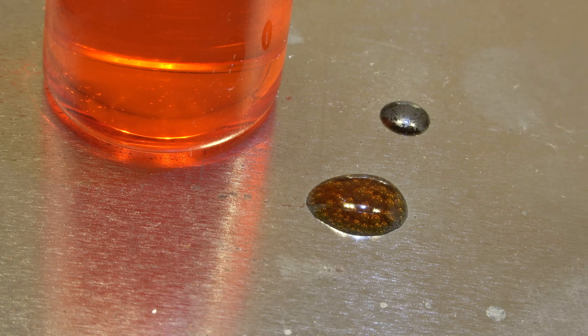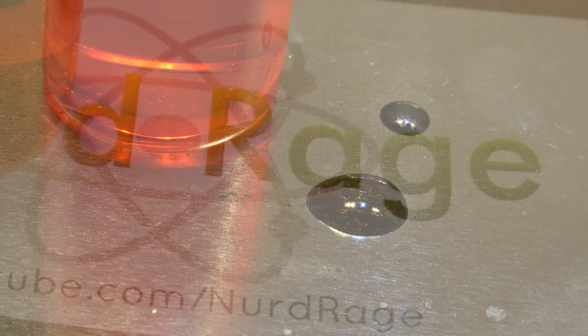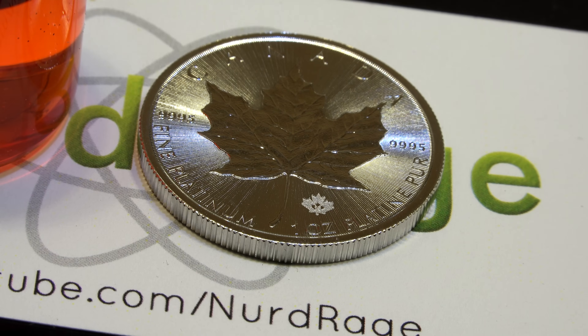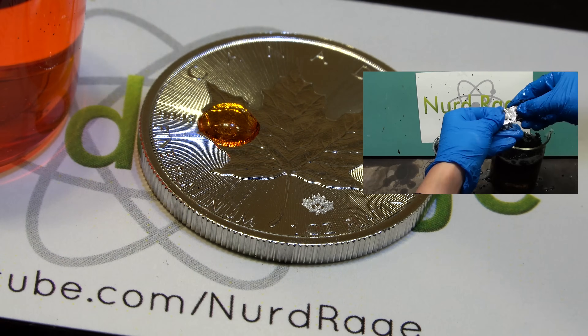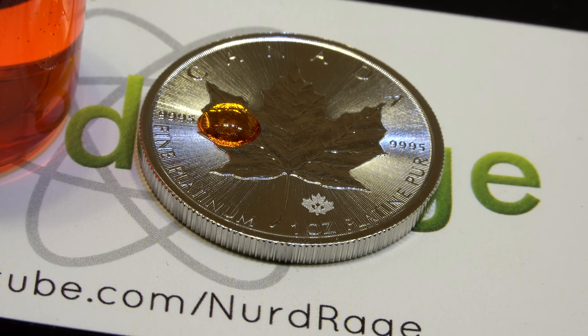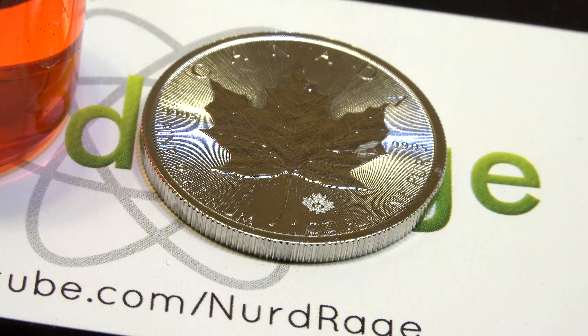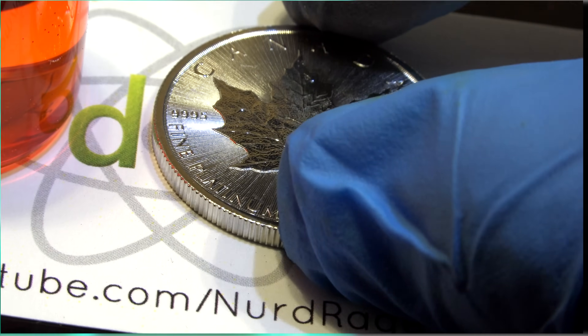Additionally, use other tests like magnetism and density to get further evidence of a metal's identity. Let me try another precious metal — platinum. Now no one will sell you platinum as fake silver, but I'm going to run the test anyway. Platinum metal is very inert, and even this solution of nitric acid and dichromate shouldn't be able to affect it — at least I hope not. I bought this coin for this video and intend to return it when I'm done, so if it comes back damaged I might be on the hook for the value of the coin. It's been about five minutes and it still looks the same. Looks like absolutely no effect — platinum is totally immune to silver testing solution.